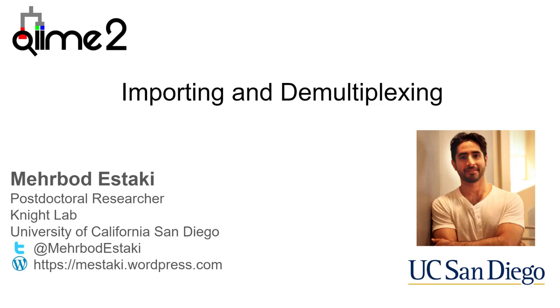Hello everybody. My name is Maribod Astakhi. I'm a post-doctoral researcher in the Knight Lab at the University of California, San Diego. In this video, I'm going to give an overview of the process of importing data into QIIME2.